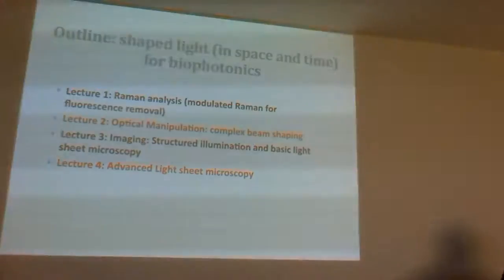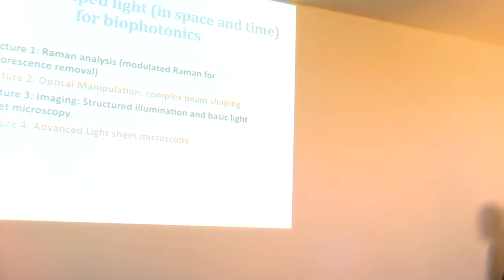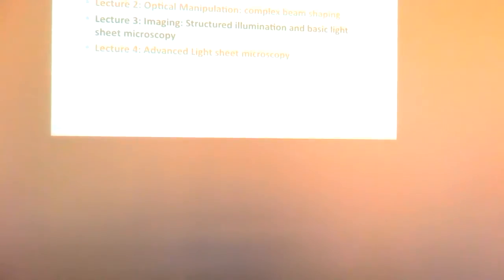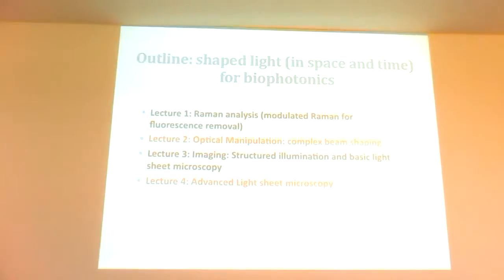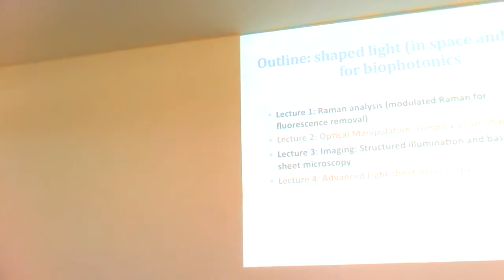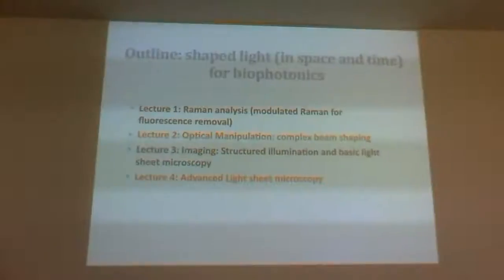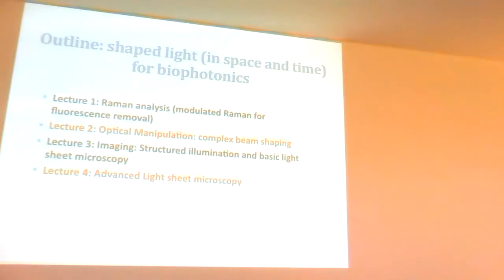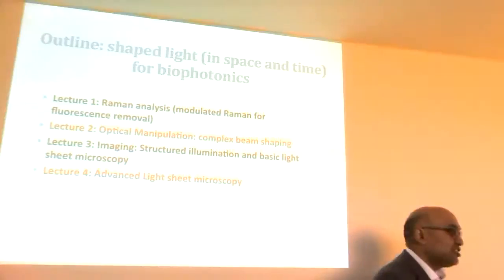So this is how I'm going to break down the lectures. I'm going to start with a lecture on Raman, which will mostly discuss things in space. Then I'll talk about complex beam shaping in the space domain, and there I'll show you how we do that work on the multimode fiber. Then I'll go on to using beam shaping in structured illumination and basic light sheet, and time permitting, I'll show you how we got that image of the zebrafish brain with low photodamage but much better resolution over a wide field of view. Now, as alluded to in the previous talk, a lot of microscopy and imaging is a trade-off.